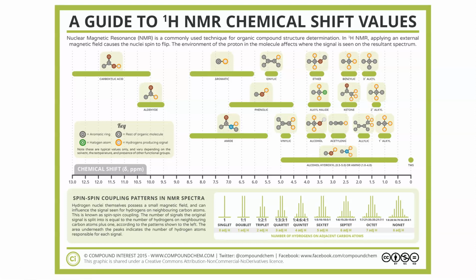So with NMR, as we talked about, the x-axis is measured in what we call delta ppm, which is referred to as the chemical shift. The resonances, or the peaks that we see, or the clusters of peaks, resonate at a different point along this axis, dependent on the energy that is required to cause the spin flips. This means that hydrogens attached to different groups will be influenced in different ways, resonating at different frequencies. Our alkyl chains, so our CH3, CH2s, tend to be quite low down in this region here at a delta ppm of around 1.